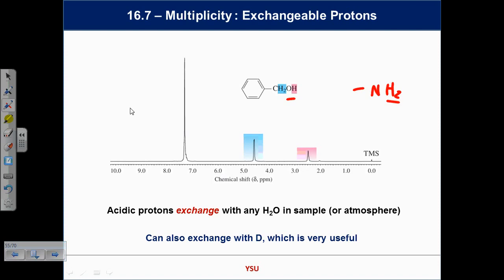If it's humid, they'll have an interference maybe with the IR spectrum. You'll see humidity, you'll see moisture in the IR spectrum. It also happens in the NMR, because these protons have an appreciable pKa. The pKa here is about 16. And what that means is it's weakly acidic, but it's acidic enough to do what we call exchange. And this idea is called exchangeability. If you identify a proton on your molecule, like a carboxylic acid or an alcohol or an amine, they can exchange with atmosphere.